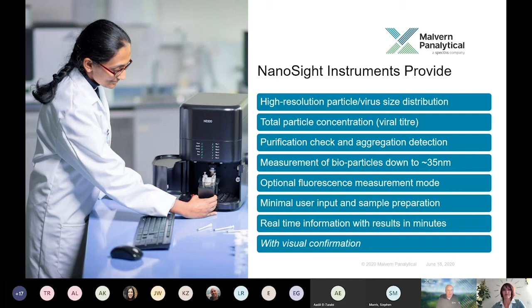The closest you can get is a polystyrene latex standard, but even that has a certain number of different sizes of particles in there. But if we could, the correlation function would contain one exponential decay rate, and it'd be very easy to analyze. As we go up in polydispersity, we have more and more decay rates, and it becomes mathematically more challenging to extrapolate all the different decay rates and hence the different sizes that we've got in there.